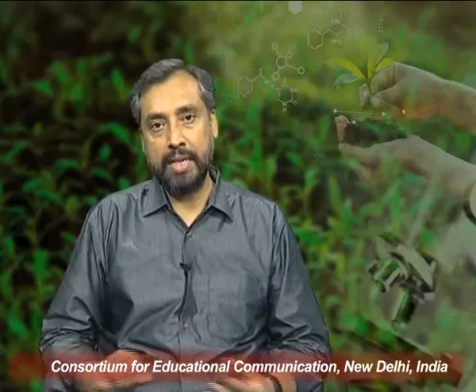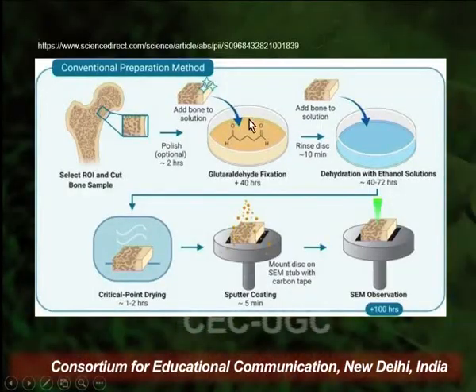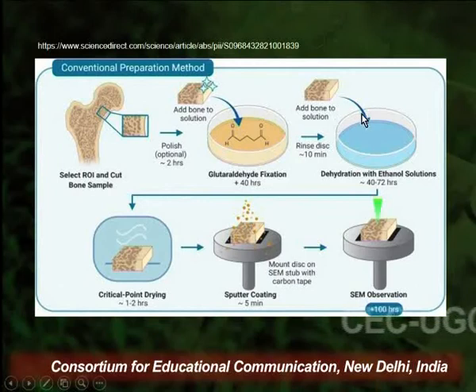So this entire process of preparation of any sample can be summarized with the help of this diagram. Any sample from any biological object is first treated in glutaraldehyde. They are fixed, and they are fixed overnight, and then after the process of fixation, the sample is transferred for the process of dehydration.